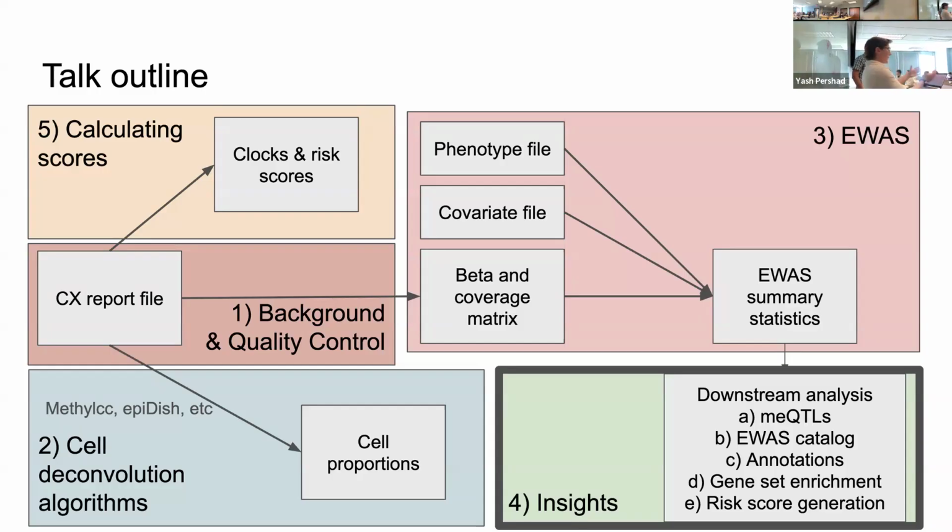So in terms of that, you'll lose any sites that are missing, but because of how complete this is, I would just impute any missing data. You've limited it to a very, very small amount of missing values across your CpGs and your samples, so I'd go ahead and impute. Then you just have a complete dataset. That can take a lot of computational power depending on your sample size and the CpG set that you have. But that's what you're going to use for clocks, for cell type estimation.